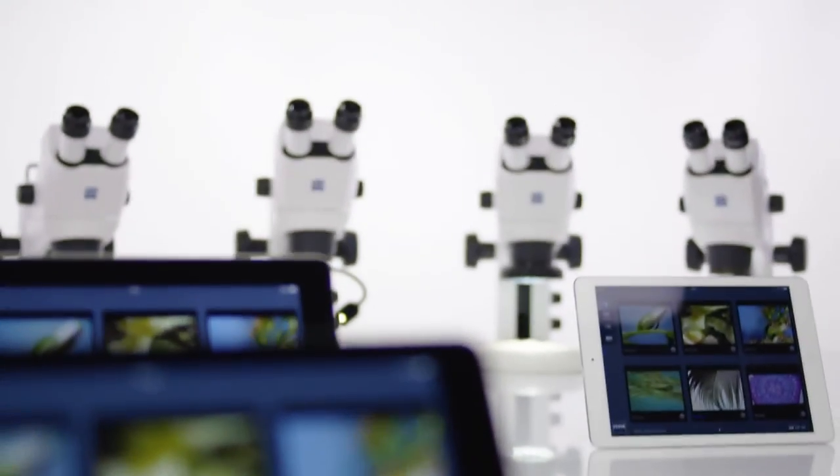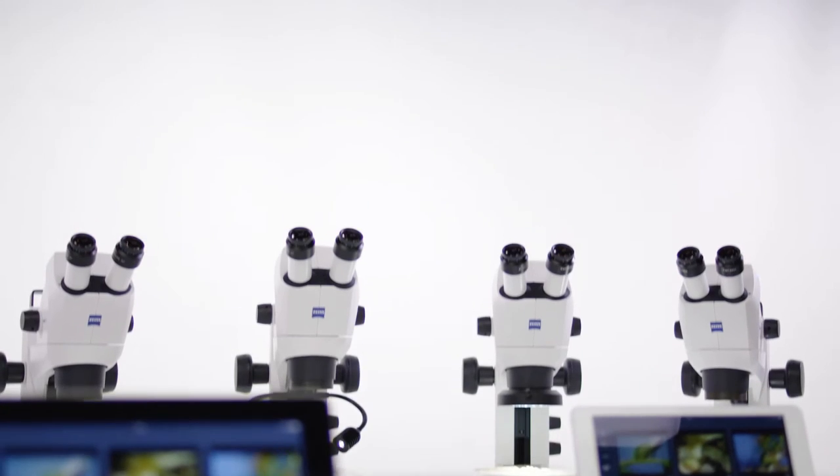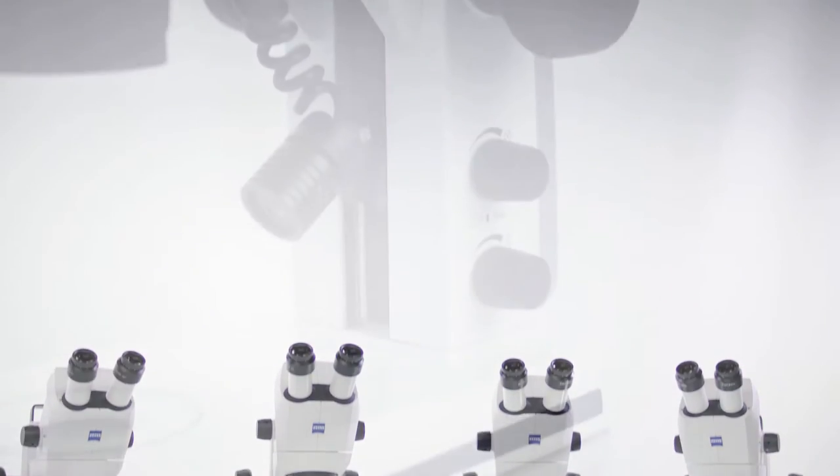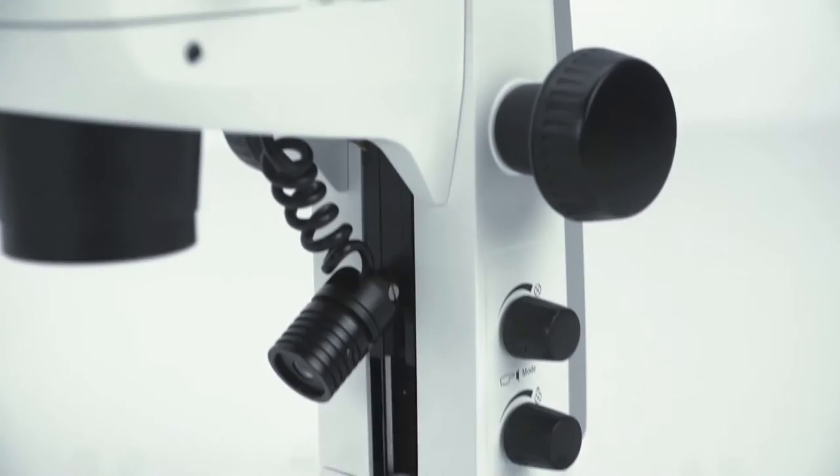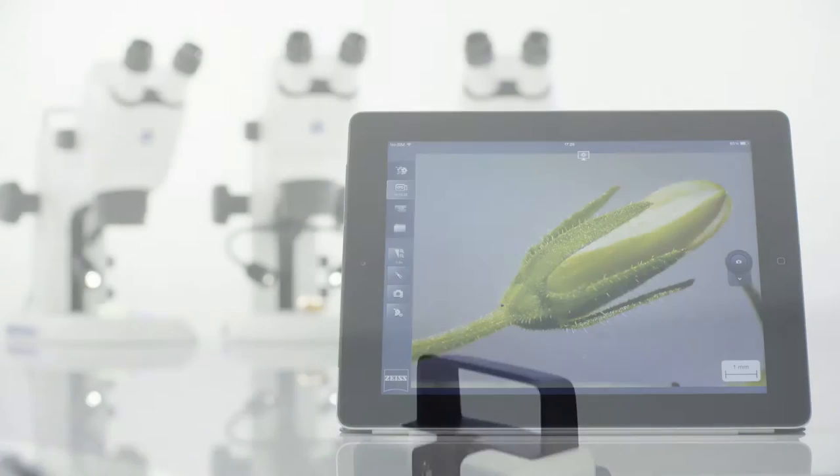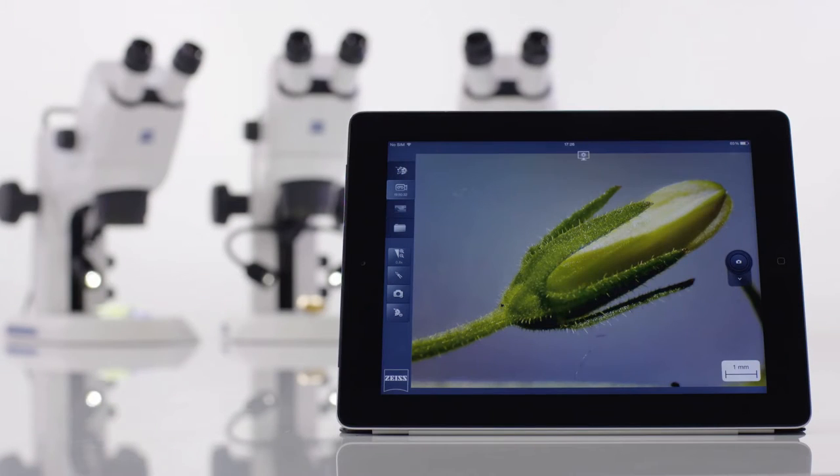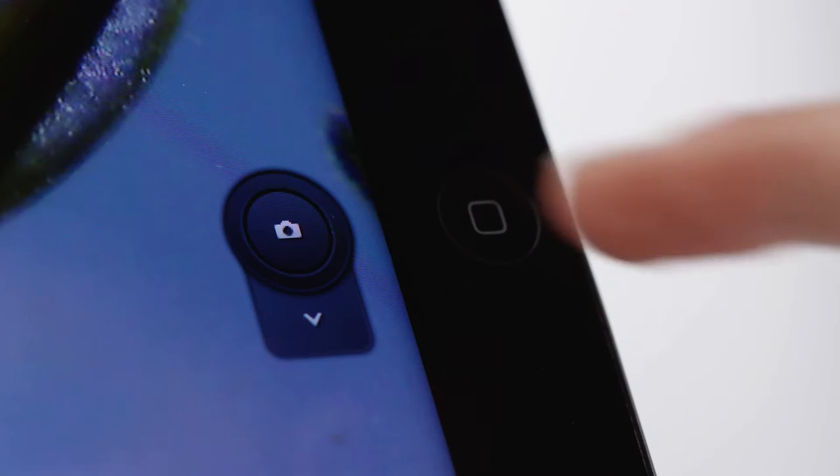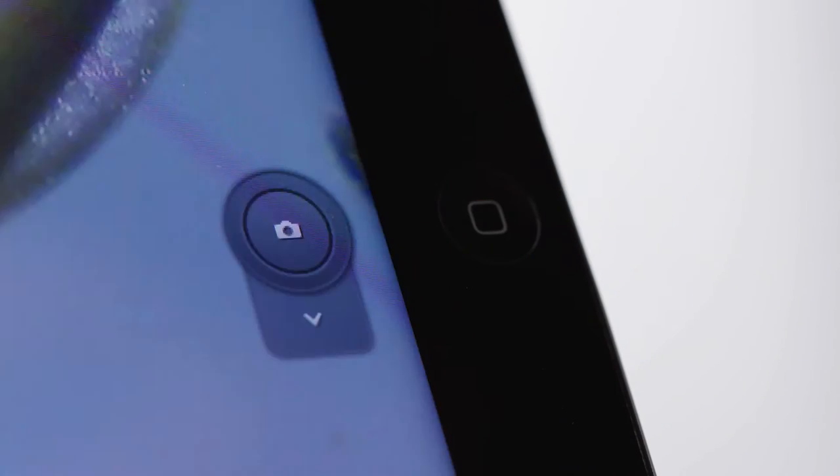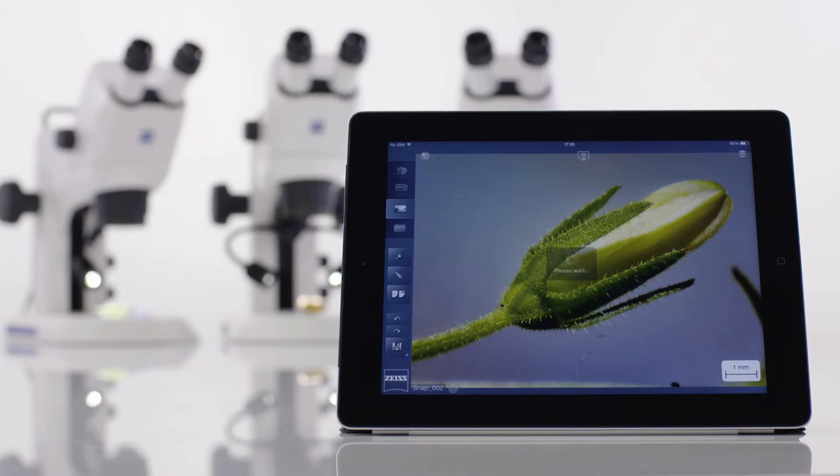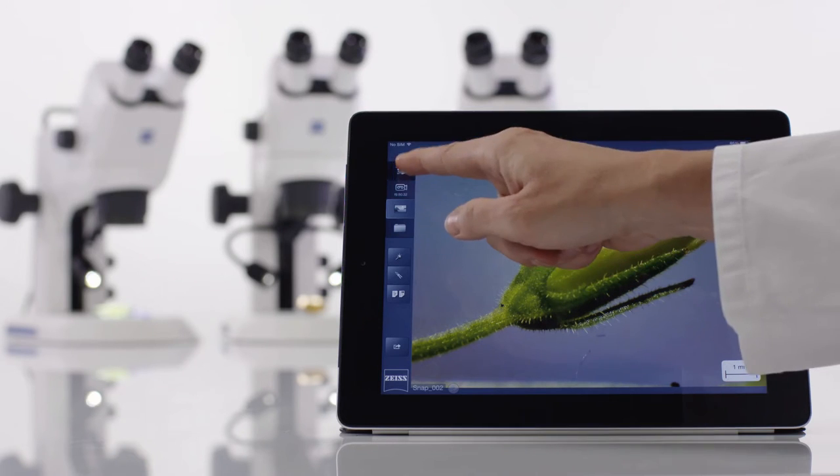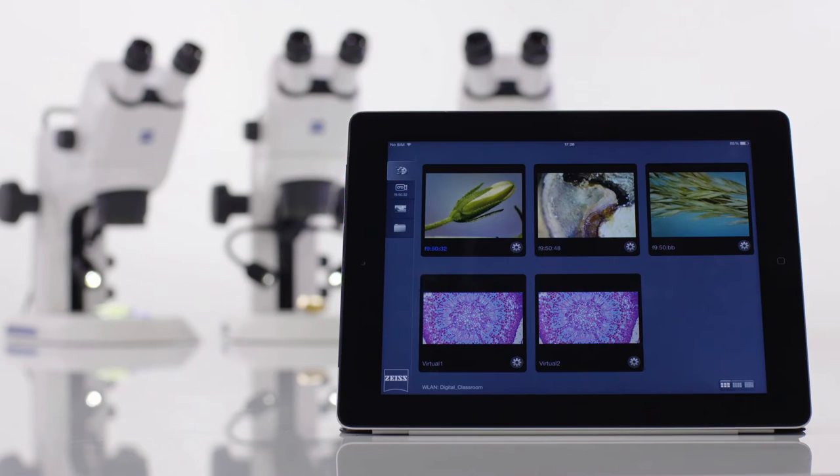This compact and easy-to-use stereo microscope comes with an integrated camera and Wi-Fi router. That means you can view and snap an image, add annotations and measurements, and then save it or export it directly to your server.